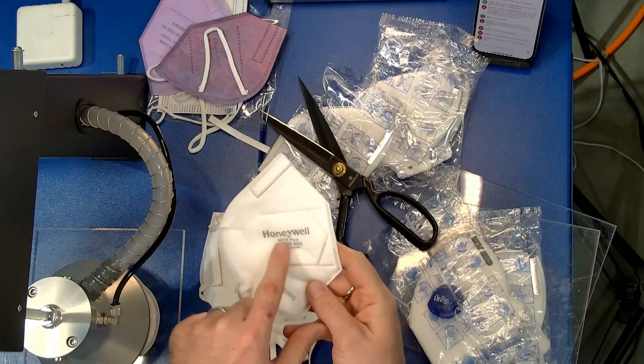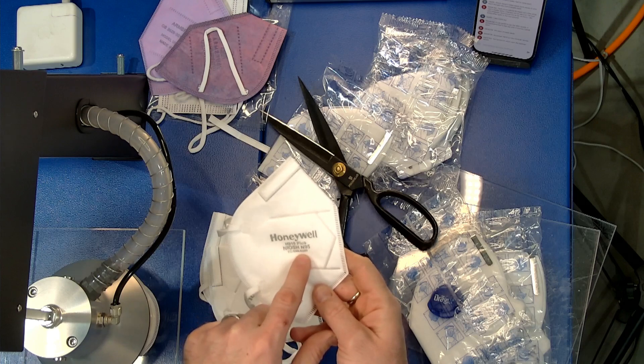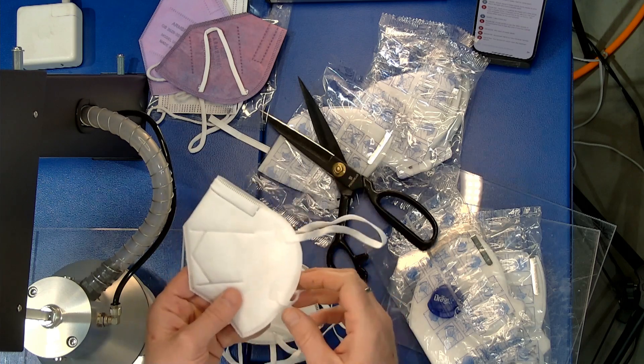Looks to be like a legitimate N95. It's got the lot number, which is an optional feature. It says Honeywell, it's got the model number and the TC number right on there. So I would guess this is gonna pass. NIOSH is really good about policing manufacturers, so I'm gonna try this on even though it was bare in the box.